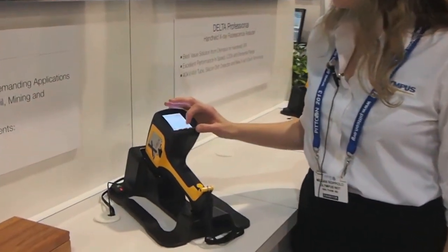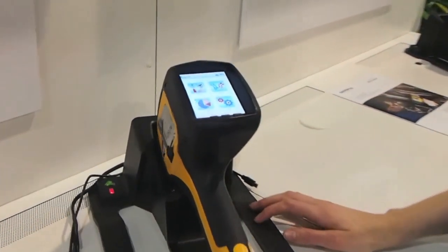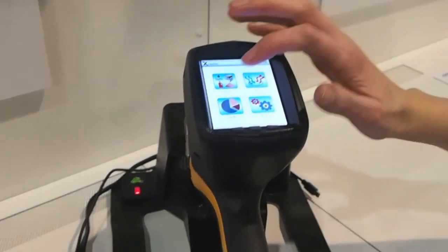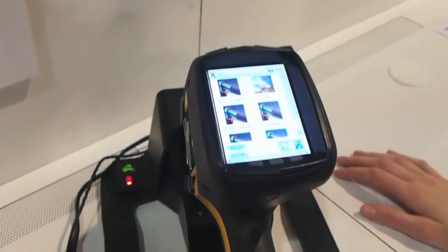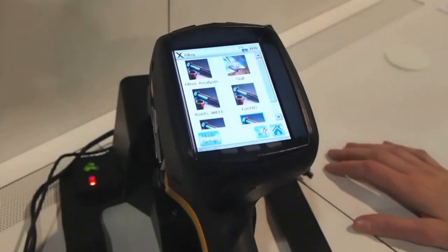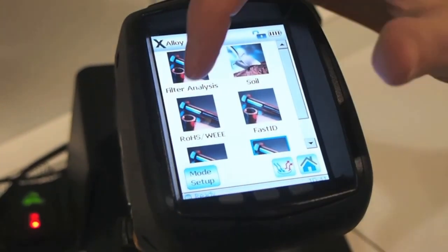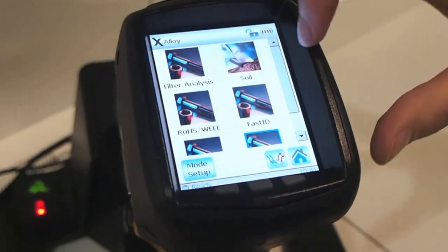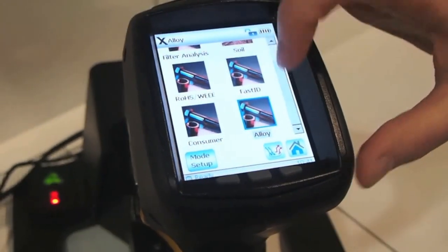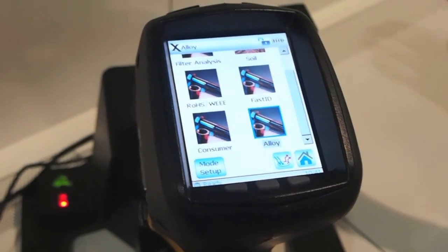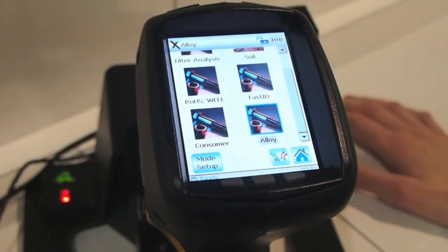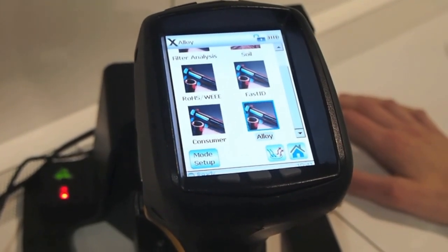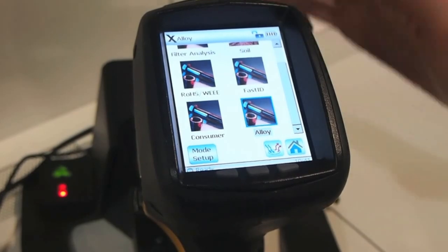This is an instrument that is useful for a lot of different applications. On our mode screen we have several calibrations for soil analysis, for consumer products testing, for alloys. We also have applications in mining and soil remediation.